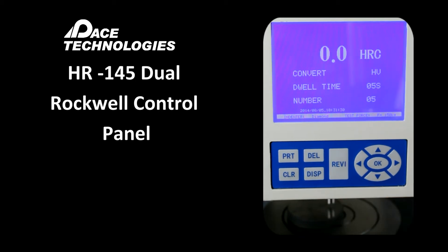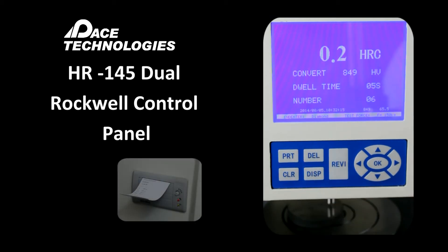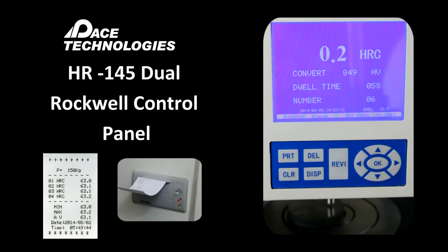Let's go ahead and make another indent. As we apply the load, it will increase up to about 580. The minor load is being applied, then it shifts to the major load, which counts down the dwell time to zero. After counting down, it gives us our hardness measurement — in this case, 65.5 Rockwell C. Backing off the stage and pressing print will print out the results obtained at this point.